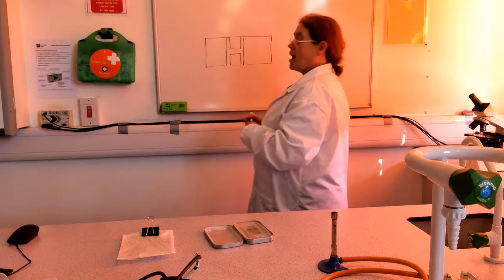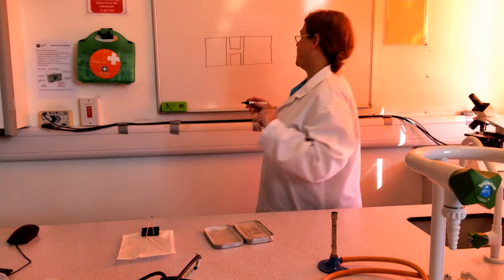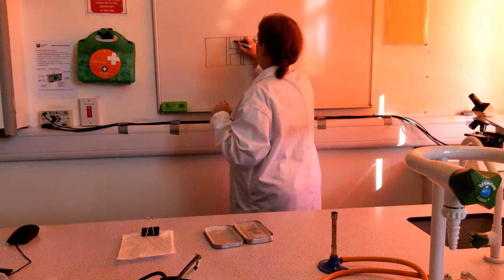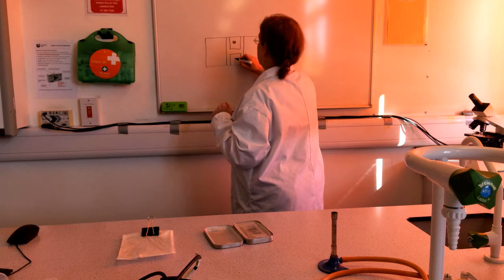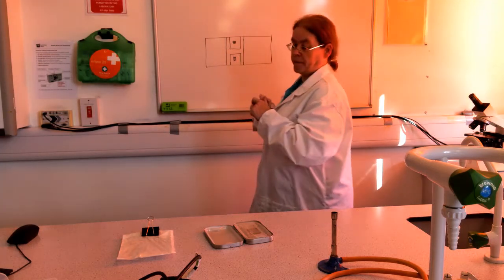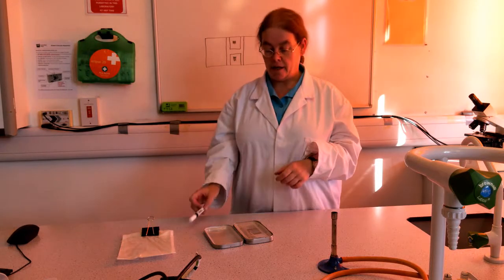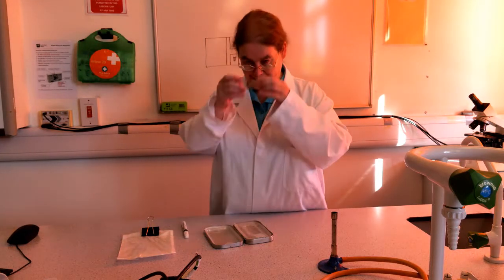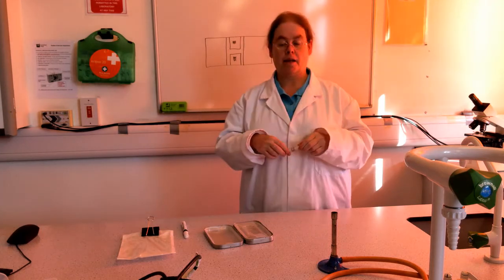Oh well. And in fact, although you can't see it with the naked eye, in here there is a tiny, tiny little grid drawn on, where the whole grid is like 1 millimetre, and you just can't see it. It is there, but you really can't see it.